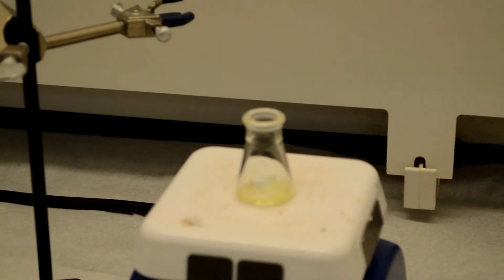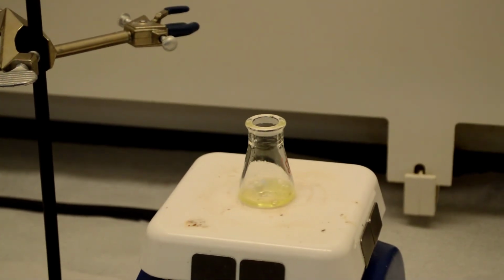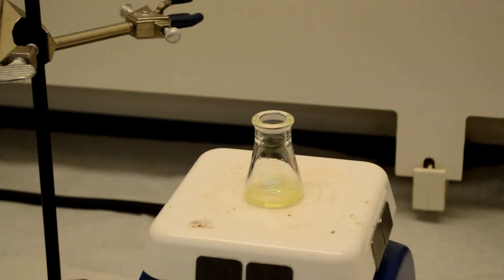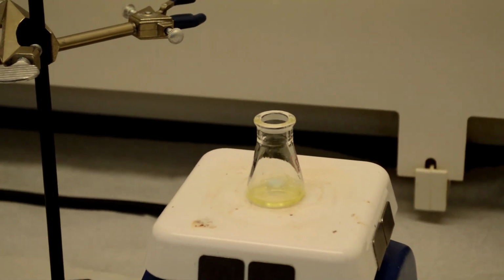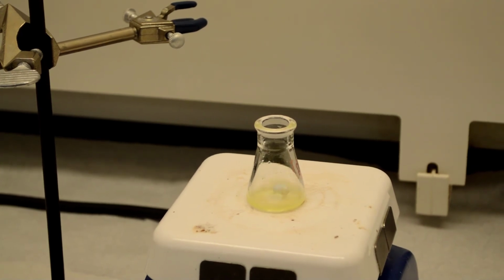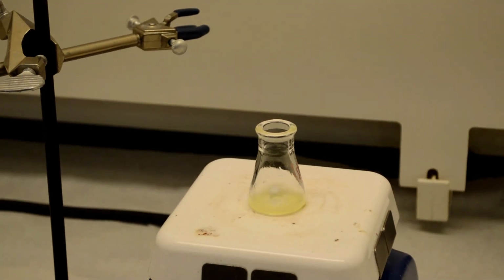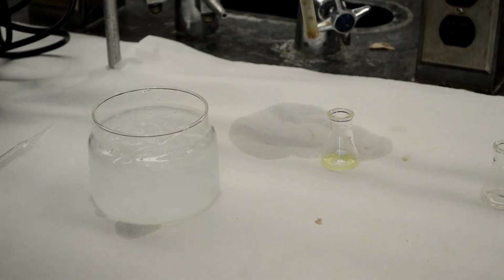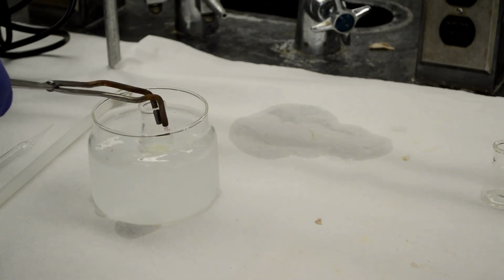You can see that I'm stirring the mixture that has our crude product and methanol, and all of that is dissolved. Once all of the compounds are dissolved, we can transfer this mixture into an ice bath to selectively crystallize our product. Remove the stir bar and place your product in the ice bath. This will crystallize our product.